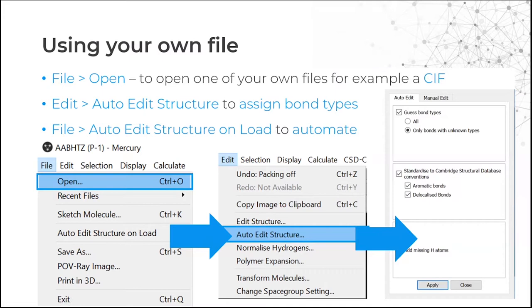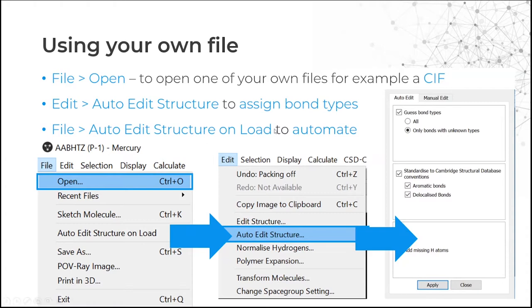We've seen the structure navigator, but you might have your own structure. To open your own file, go to File and then Open. You'll most likely be using a CIF file, though other file types are supported. A CIF file doesn't usually contain chemical connectivity, so you need to assign bond types. To do that, go to Edit Structure and Assign Bond Types. You can also make Mercury do this automatically on load by going to Edit Structure on Load to automate.